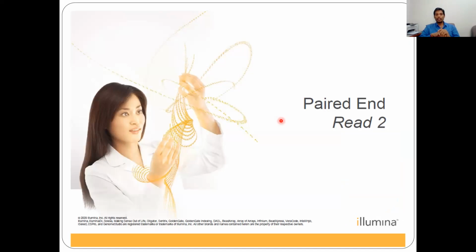After that, there is a limitation; it will not get sequenced. That was the case when it started in the 2010s and 2011s, with 75 nucleotides. But with advancements in the last few years, it can sequence up to 300 nucleotides in one stretch. But anyhow, there is an advantage of the Illumina.